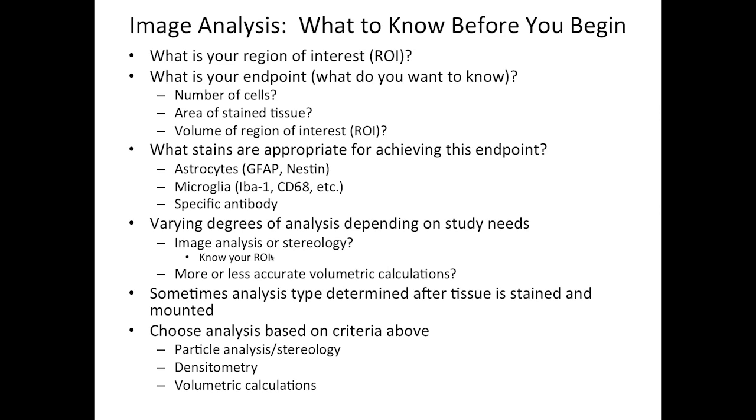Another example is more or less accurate volumetric calculations. There are different methods for doing this, and it ranges from a less accurate method of calculating volumes to more accurate methods.